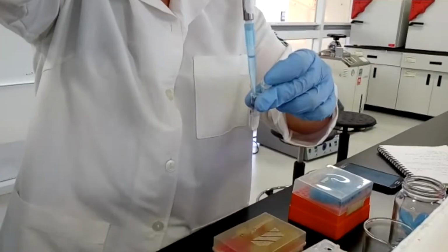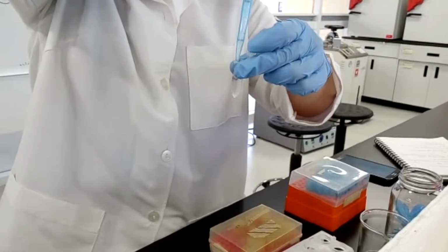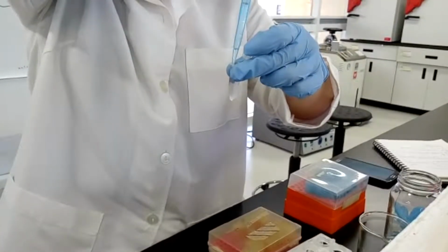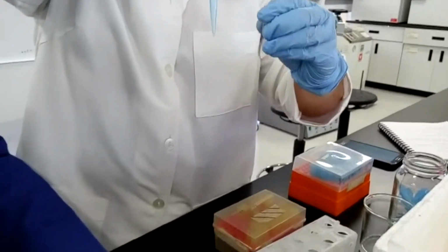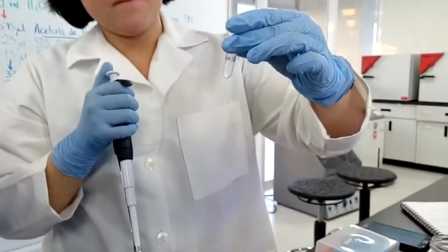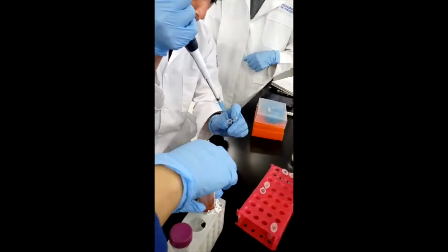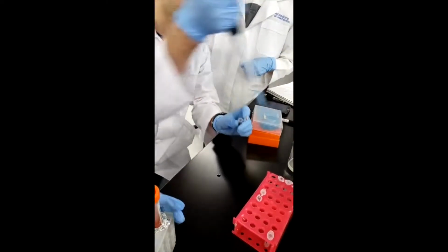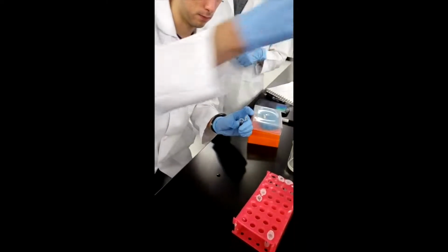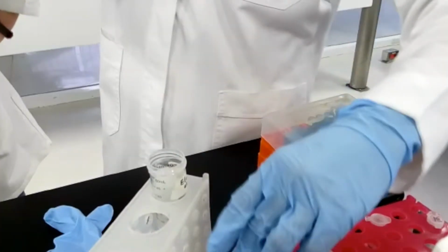Samples did not have a great quality. The ratio from the absorbances gave values below the ones of a pure sample. For DNA, the value from the sample was 1.51 and the expected was 1.7. For RNA, the value obtained was 1.42 and the expected from a good sample is 2. From the DNA, there were 1.510 micrograms. From the RNA, the sample contained 4.925 micrograms.